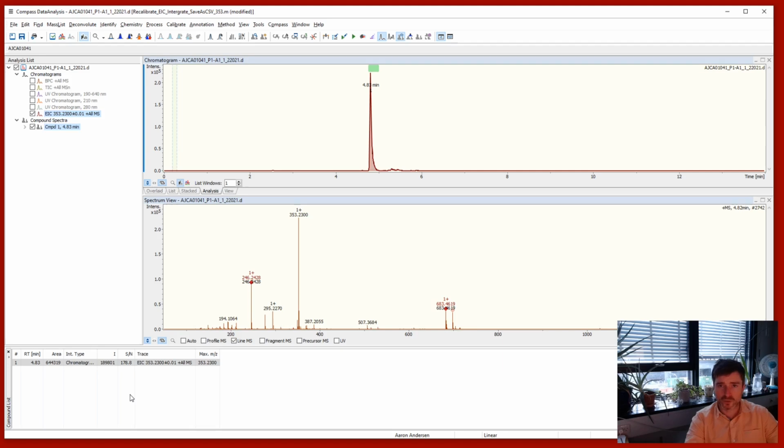There's also an automated process to do this. If you have, say, 50 or 100 data files, you probably don't want to do it in this manual sense, just because it's going to take much longer and it's very tedious. To do that, there are two other programs that you will have on your computer.